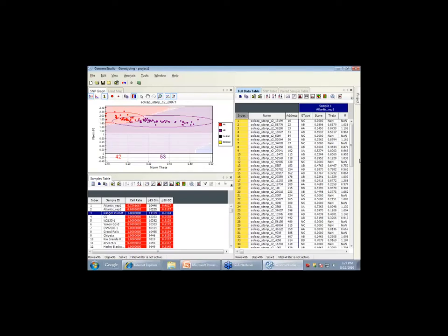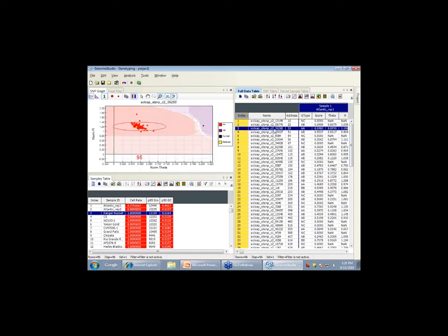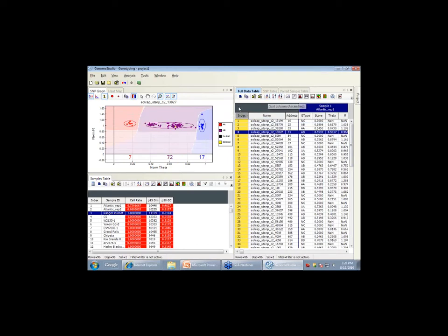Okay. I'm running a little short on time, so I'm going to show you a couple more things. I'm going to pick a SNP that's fairly clean. I sorted back by index, so I just hit the sort key, went over to index, sorted, and picked SNP number 4. Now I'm going to shift a couple things, and it doesn't matter what you do. I'm going to shrink this, and I'm going to move this.